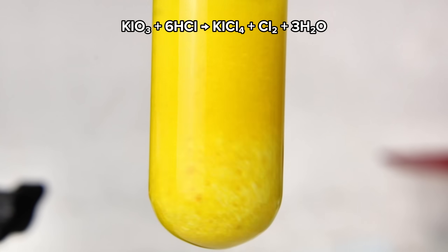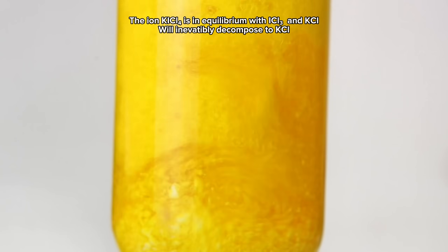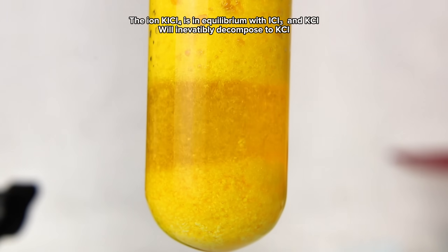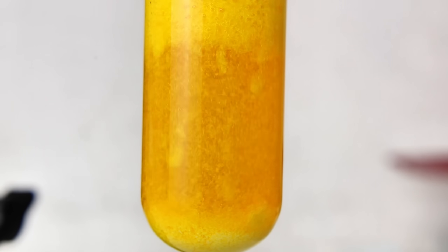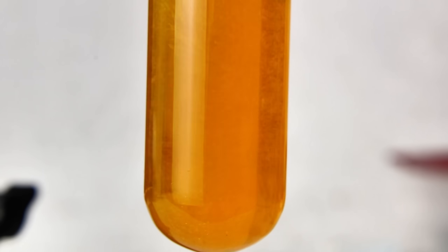I used a small butane lighter to make sure that all of the potassium iodate had completely dissolved, and then I allowed the solution to cool. As it cools, long thin crystals of bright yellow potassium tetrachloroiodide will begin to form. These crystals are absolutely beautiful, and their distinct yellow color can be observed directly by pouring off the excess liquid once they've finished crystallizing.